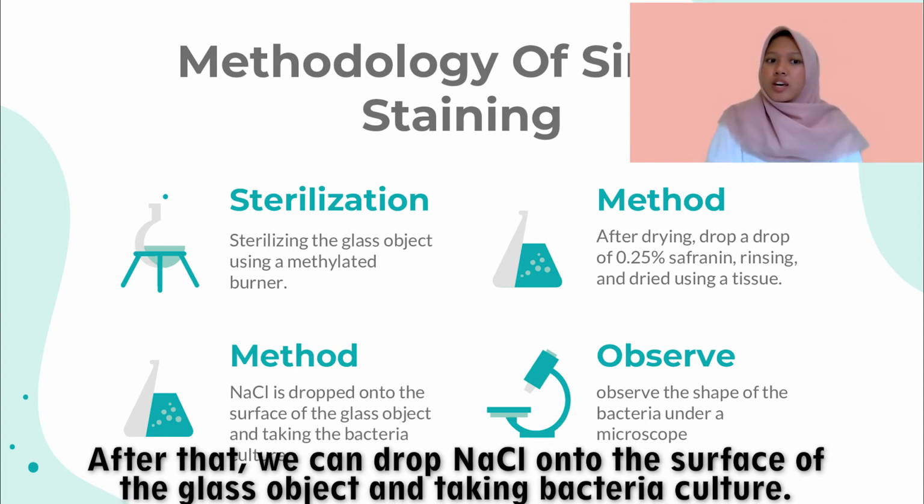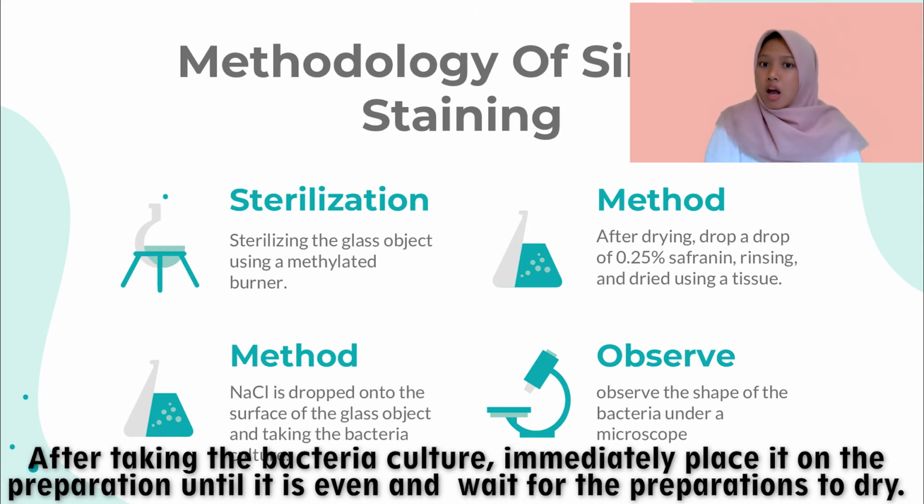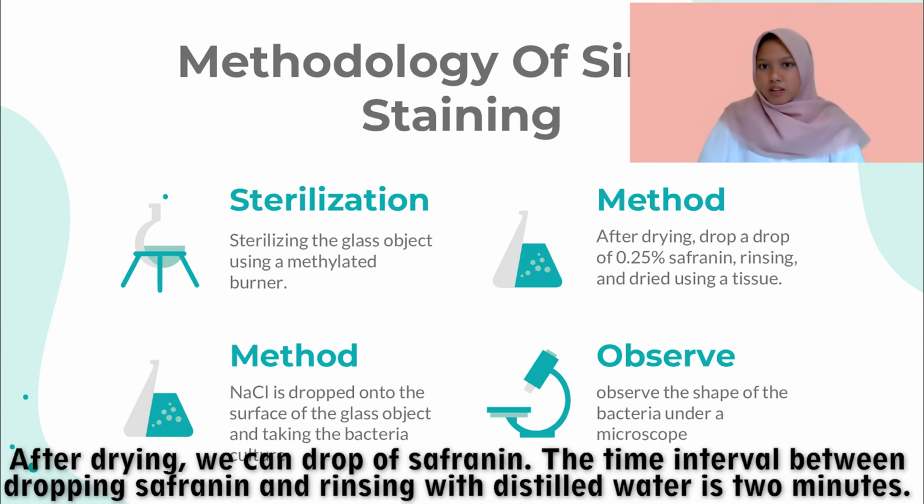After that, we can drop natrium chloride onto the surface of the glass object and take bacteria culture. After taking the bacteria culture, immediately place it on the preparation until it is even and wait for the preparation to dry. After drying, we can drop on safranin.